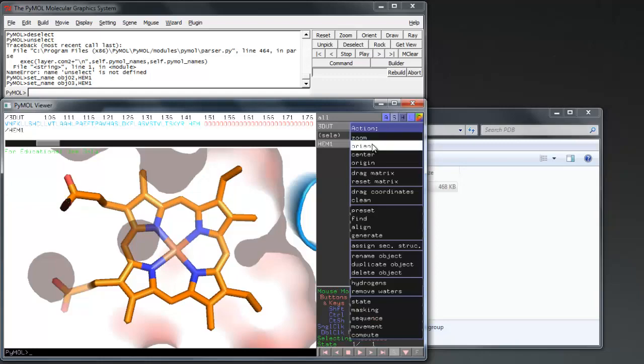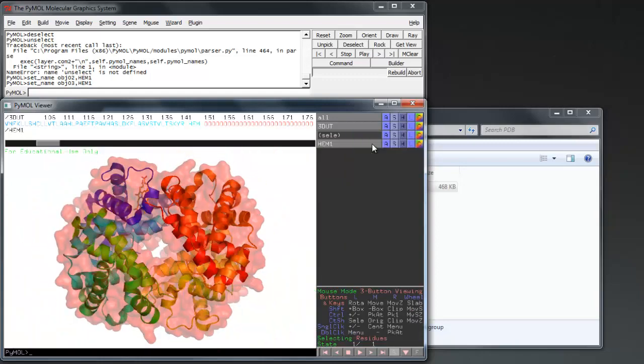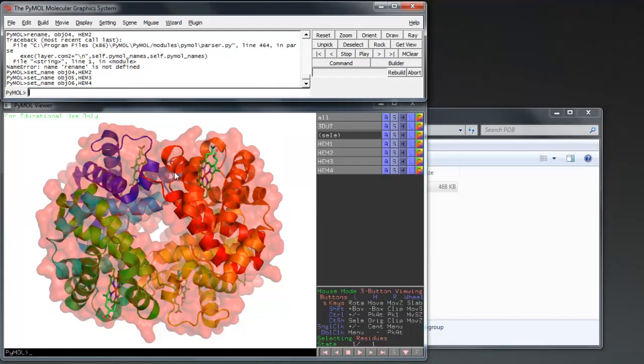Continue defining and coloring residues until you have shown all that are important for the final image. You can see here that I have defined all 4 of the heme groups.